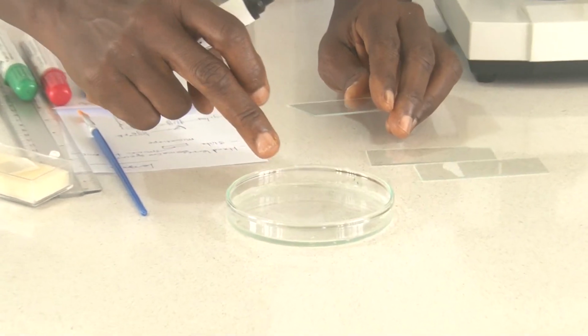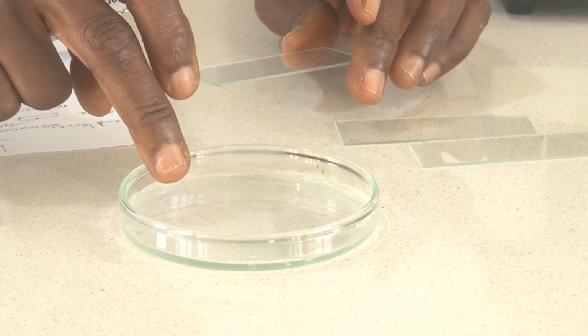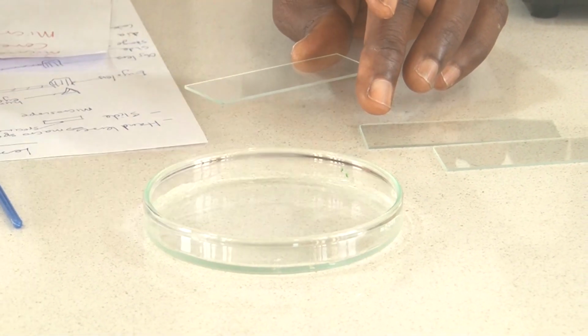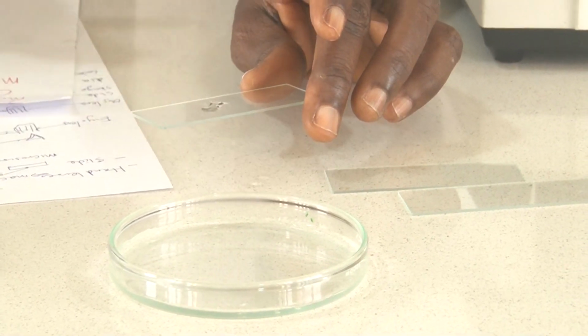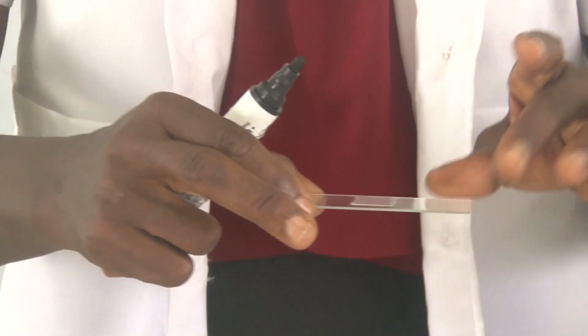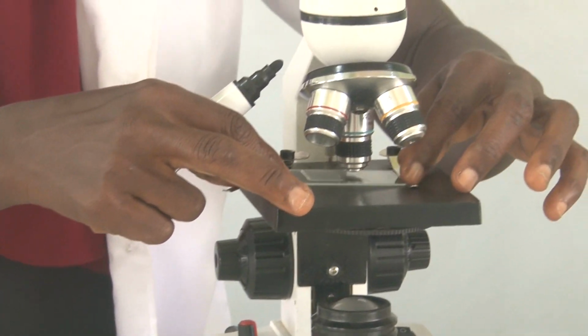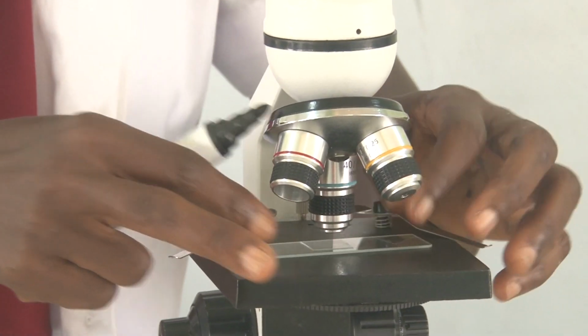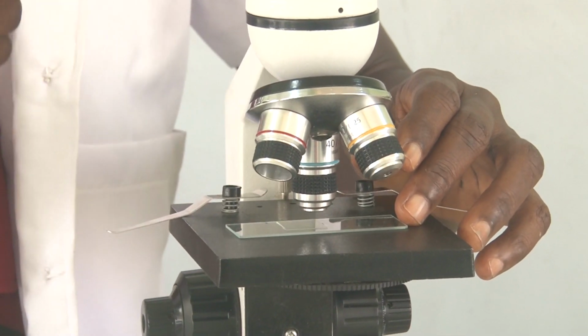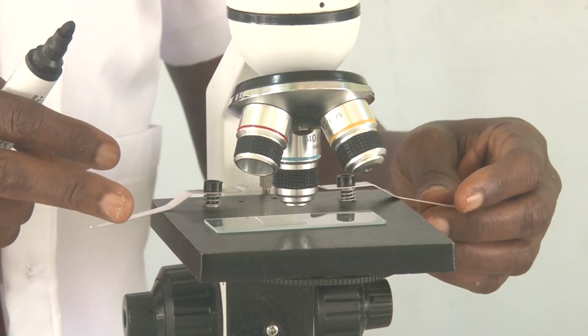And if the water has microorganisms, you cannot see them. So a little of the water on the slide, covered by a cover slip, and put under the microscope. This microscope is a device that will enable us to see the microorganisms on the slide.